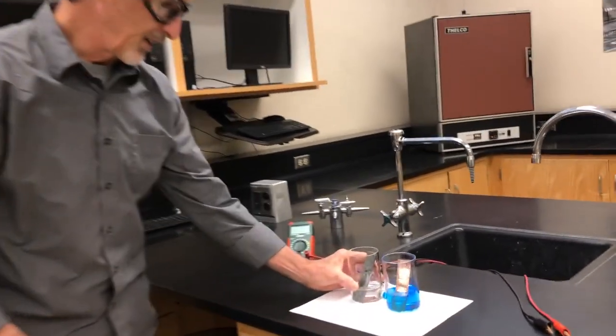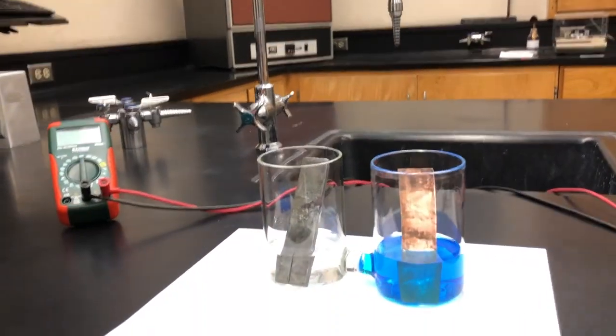Welcome everybody to our first virtual lab. This is going to be dealing with some electrochemical cells and reduction potentials. First of all, let's take a look at what constitutes an electrochemical cell.